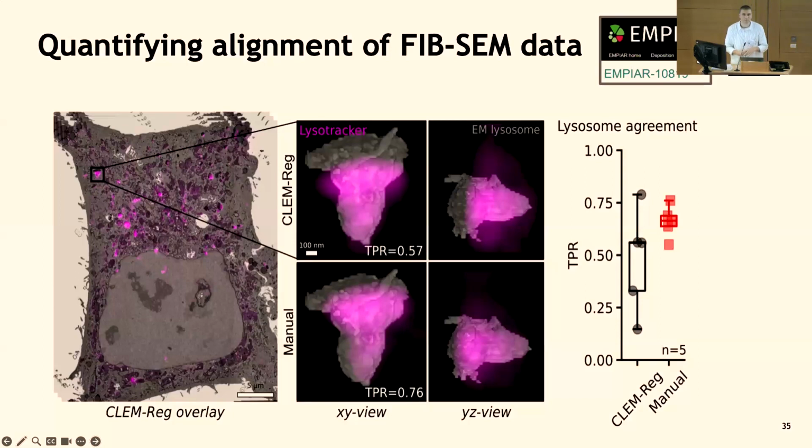Whether increasing the Z resolution of your confocal images is going to make the alignment better. I'm not too sure if that would. I'm not sure, but maybe I'll have a think about that, and I can maybe talk to you after.